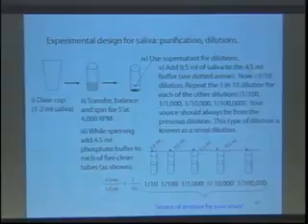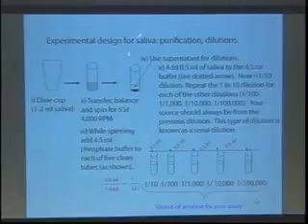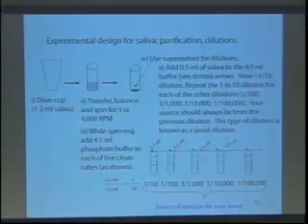I don't know why. They literally tell it to me, yeah, it's amazing. So let's just do this. Dilutions. The way we do a 1 in 10-fold dilution, you can do it many different ways. But what you're going to do is you always have your original and then a diluent. So if it's a 1 in 10-fold dilution, at the end, and this occurred during office hours, you've got to take into account your original volume.